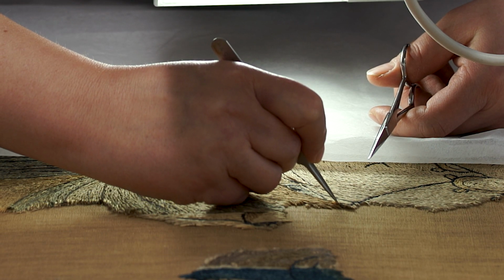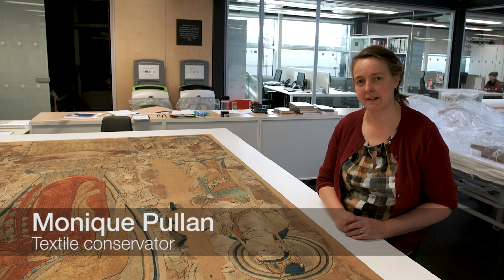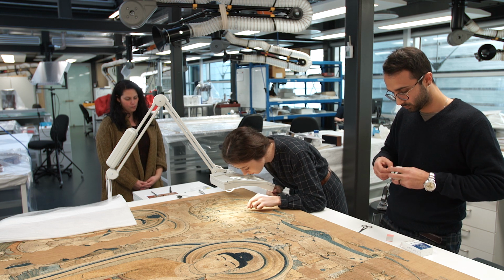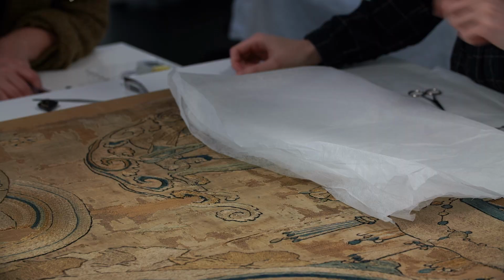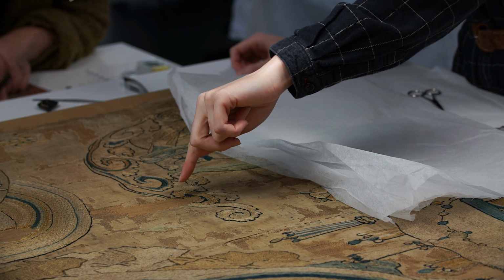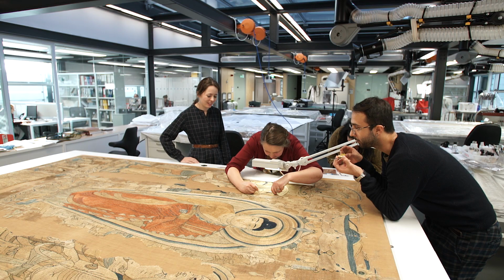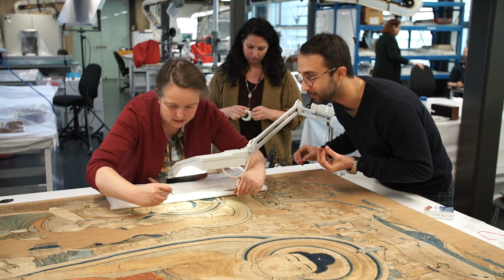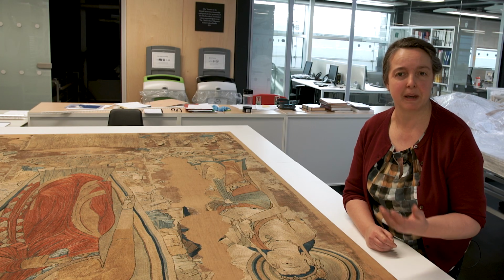So today we're going to get Diego and Joanne from Science to come up and have a look at the dyes in the embroidery. It'd be really useful to find out what kind of dye stuffs were used to colour the embroidery threads. Also, it might help us understand if the colours have changed, because we do think there are quite a few areas where we've had a lot of fading going on, and by doing some dye analysis we might actually find that maybe some of the beigey browns were actually maybe pinky red colours.